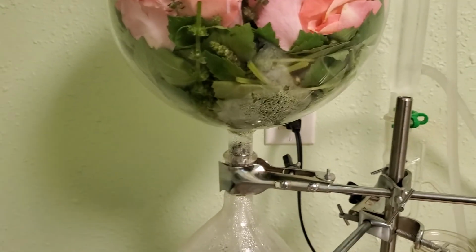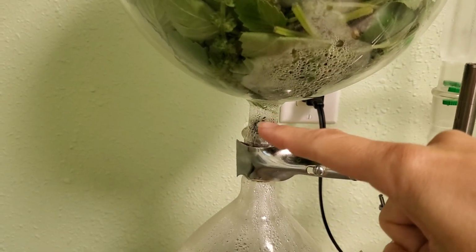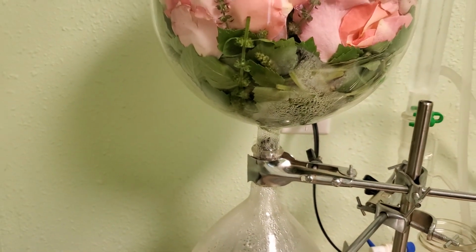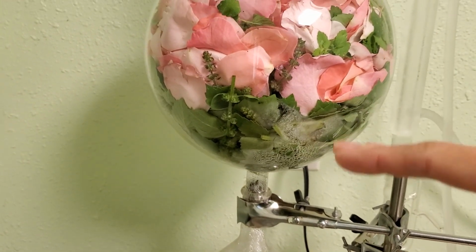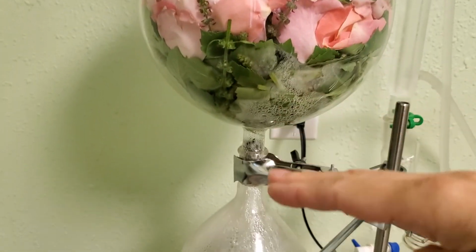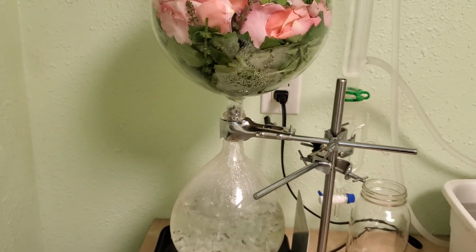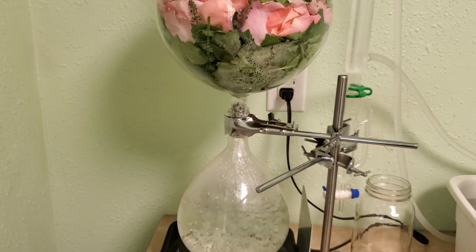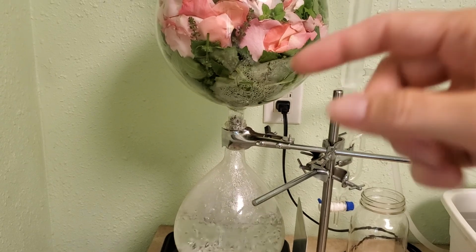Right here between the two flasks, now that there is a lot of condensation, it might be kind of hard to see, but right there by my finger, there's actually a little rolled up piece of wire mesh. And that just helps keep herbs from up in this flask falling down into this flask. What will fall down into this lower flask over time are any type of materials that are picked up in the steam and then condensed down that are heavy.